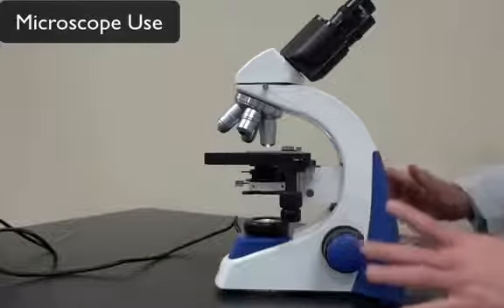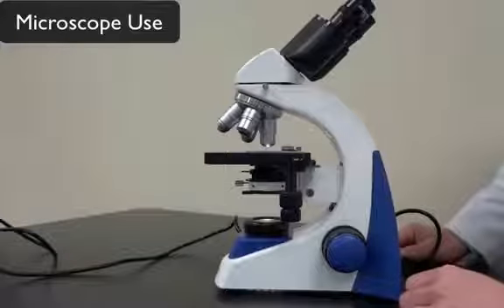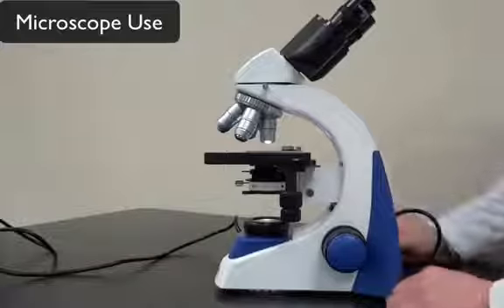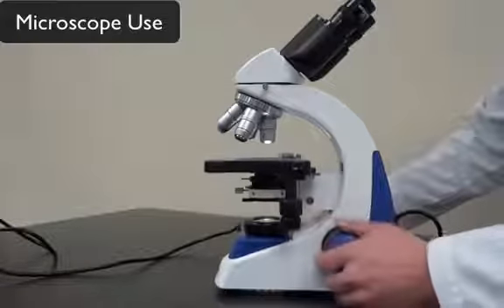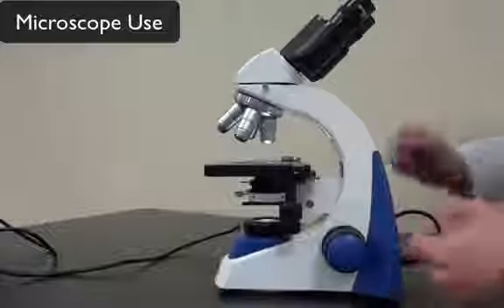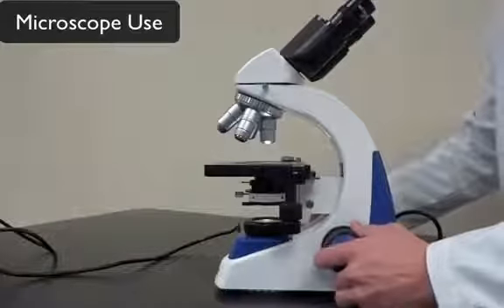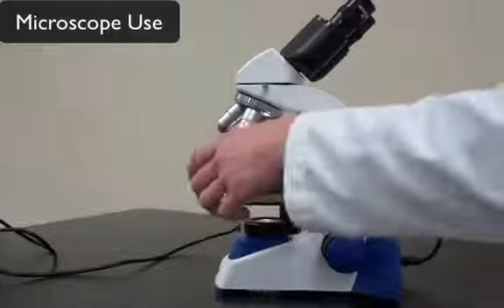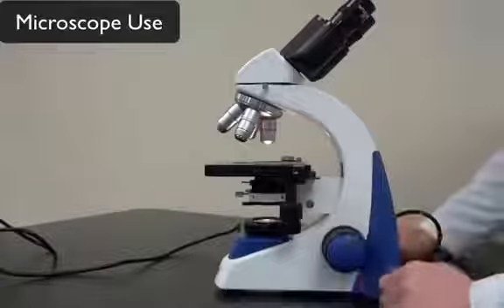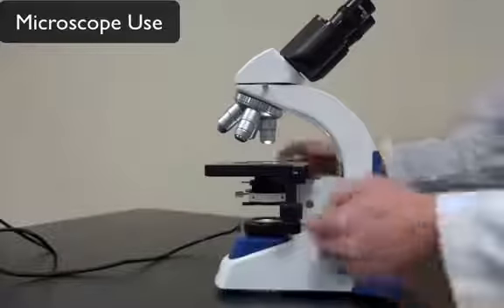Okay, so let's say you're done with this slide, or even done with the lab looking at the different slides. What you want to do is go back down to the scanning objective lens, and then lower the stage. You don't want to lower it down in high or low power, in case you're going the wrong way, because you can break the slide and damage the objective lens. So you always switch back to the scanning power, lower it all the way down, open up the stage clip, and then let the slide down very carefully. If you're going to do another slide, you can put that slide on, let it lock into place, and go through those steps again.